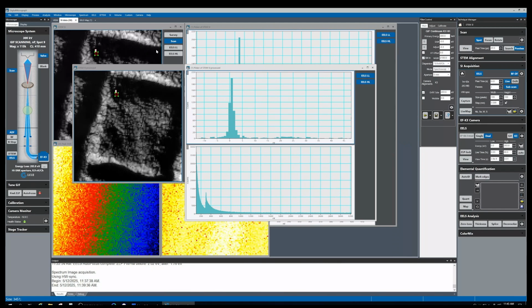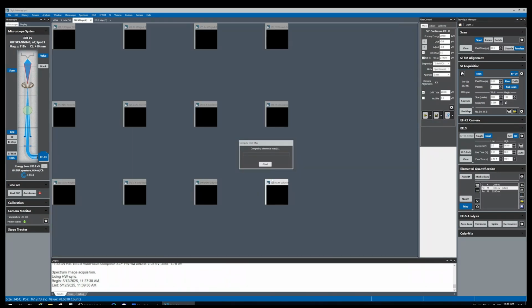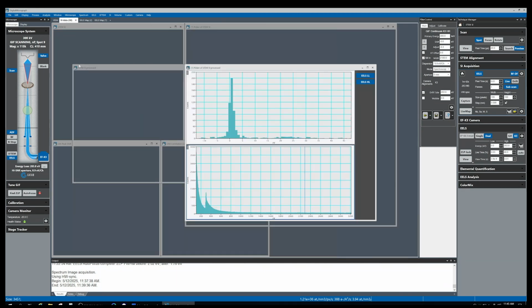With this calibrated EELS dataset, we can try to generate the elemental map again. But honestly, I don't think we will get anything different, because the elemental maps are not very sensitive to the exact edge position.